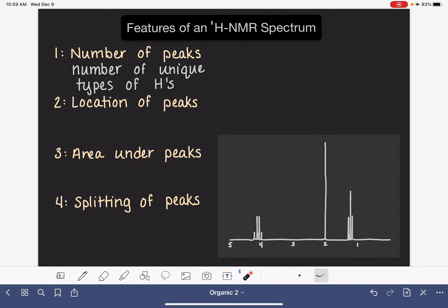Also I want to point out that each individual little spike in an NMR spectrum is not considered a unique peak. We're looking instead at these clusters. So in this particular NMR spectrum, we see there are three peaks. There are three clusters or three areas. So each one of these clusters corresponds to an individual peak.